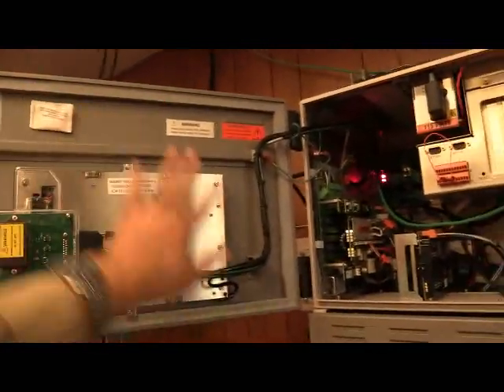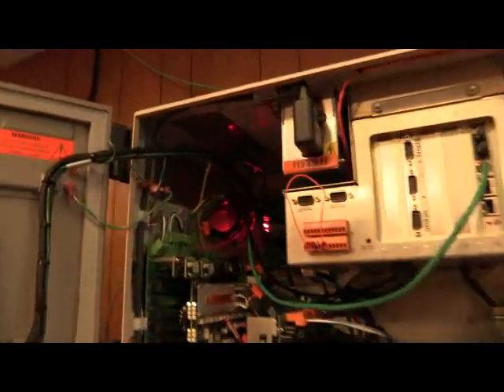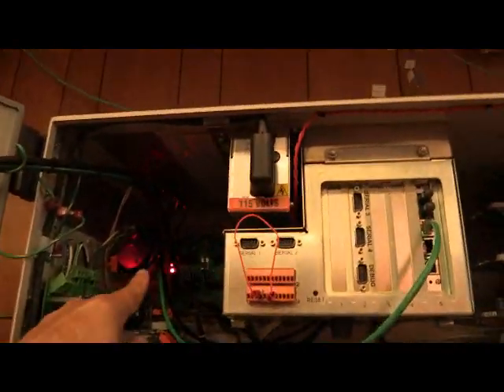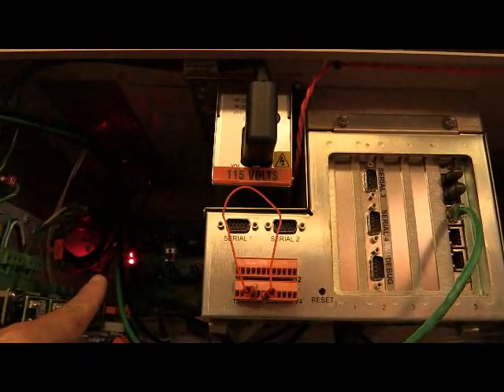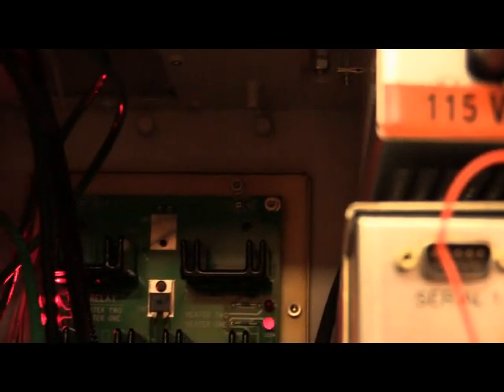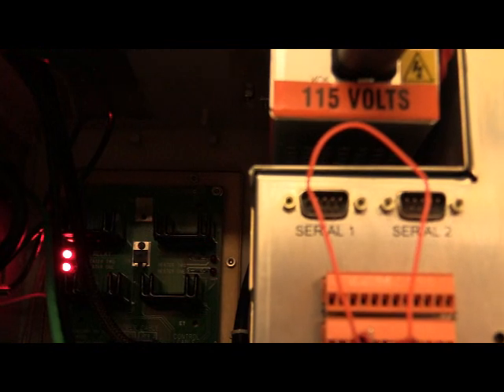All of this used to be a lot different than what they are. But power entry control module, PECM, power entry control module, it distributes a lot of the power. There are the same type of relays, just newer versions of them, as what we were just looking at over there. You have an overtemp relay and a control relay. If you notice, those overtemps are just going to stay on and let you know that you're okay. And then you're going to have your control temp relays over here.